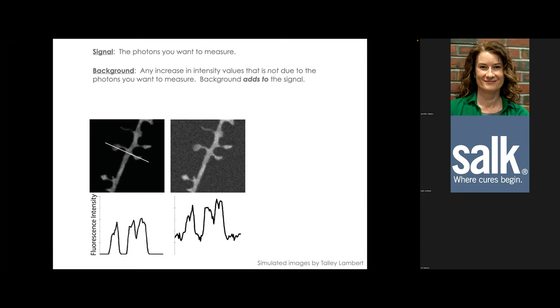Background adds to the signal. In a simulation, adding a uniform background value to each pixel causes the entire intensity curve to shift up. Because background adds uniformly, if you carefully measure the background intensity you can subtract it from your image, leaving you with the actual signal.